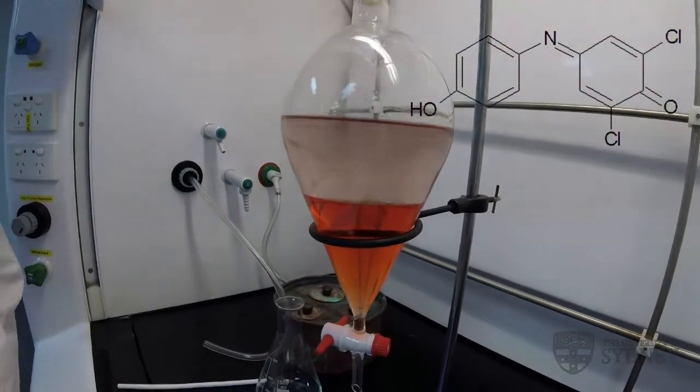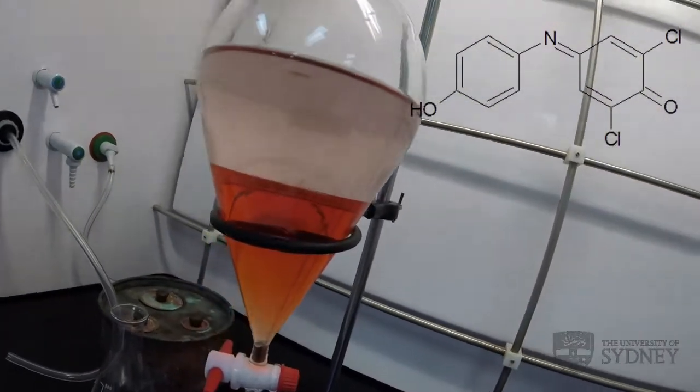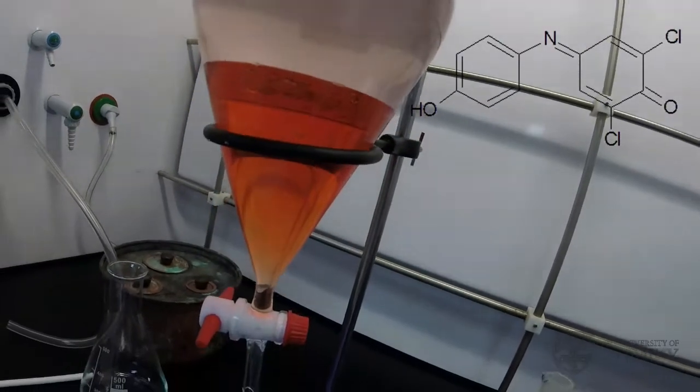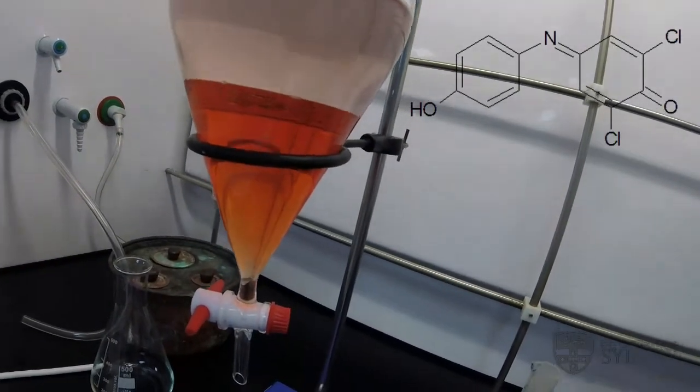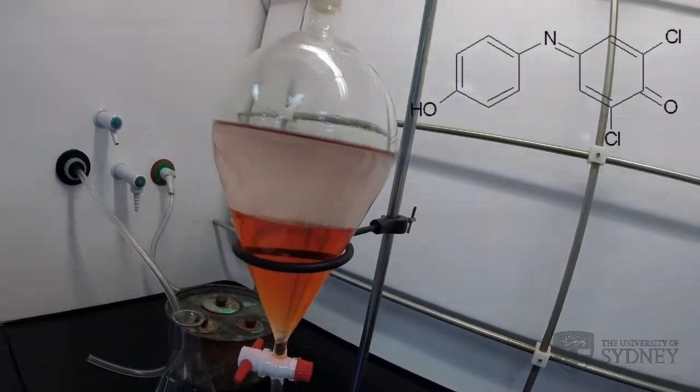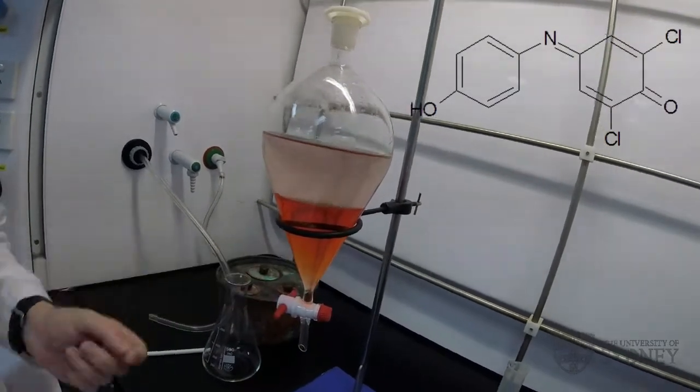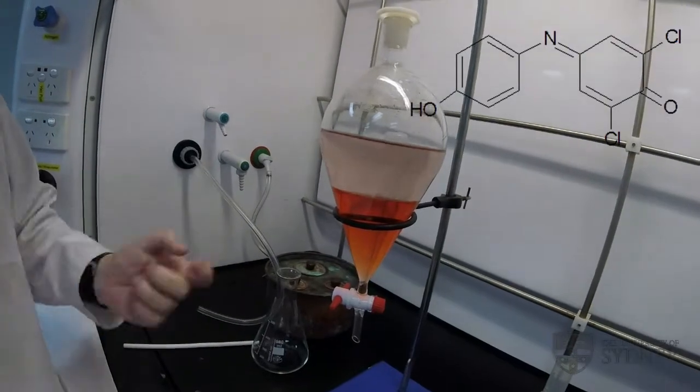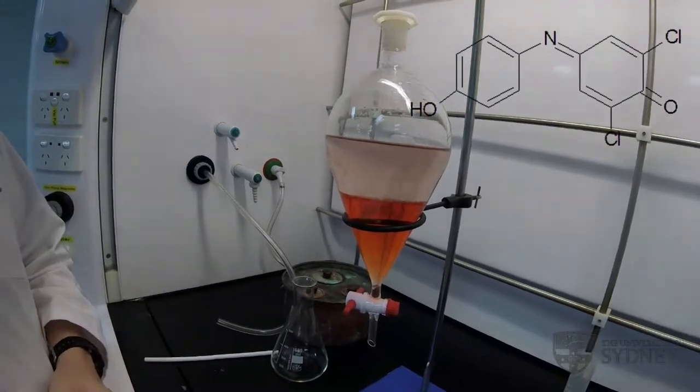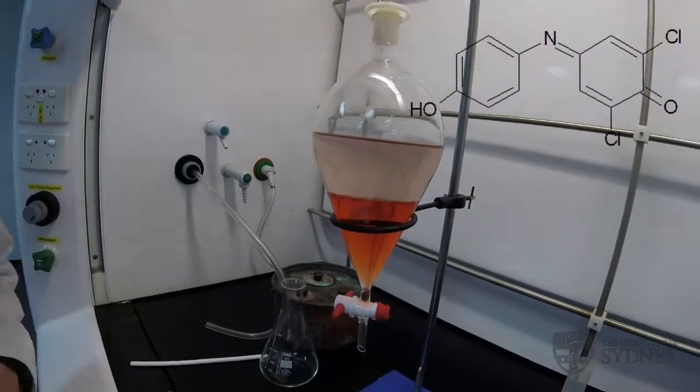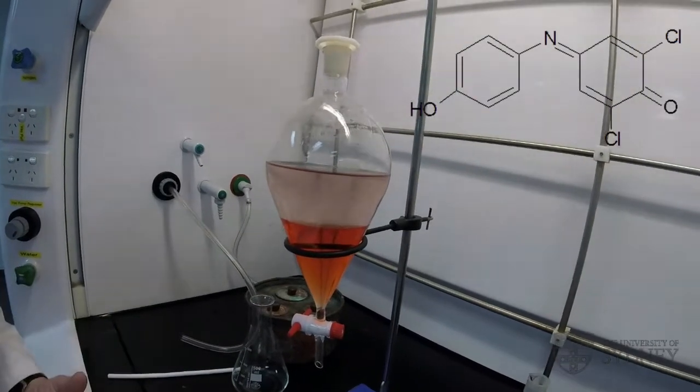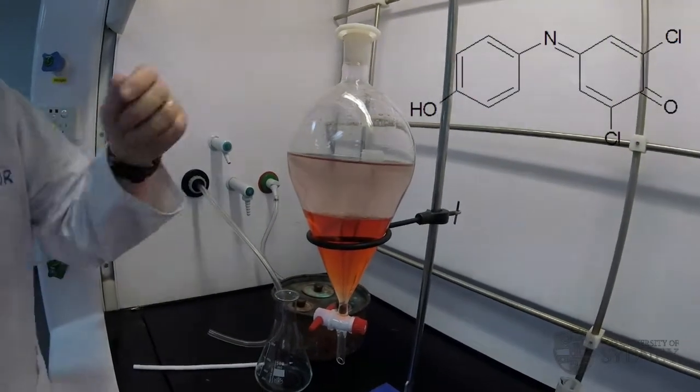Okay, so we've waited a few minutes and we can see that the top layer is almost clear. Now, if I really wanted to extract all of the dye into the organic phase and isolate it, I'd remove the bottom layer of liquid and then repeat that extraction with a fresh dose of chloroform. But we're not going to do that today. Instead, we're going to illustrate that we can go backwards and forwards with this separation.